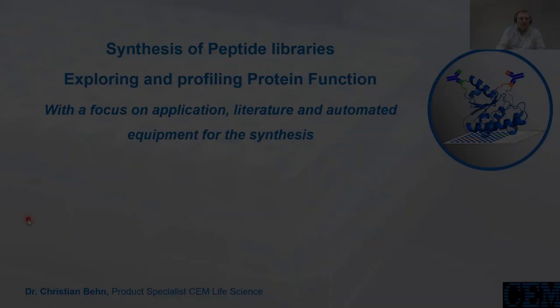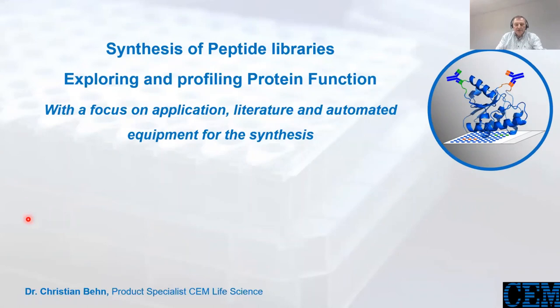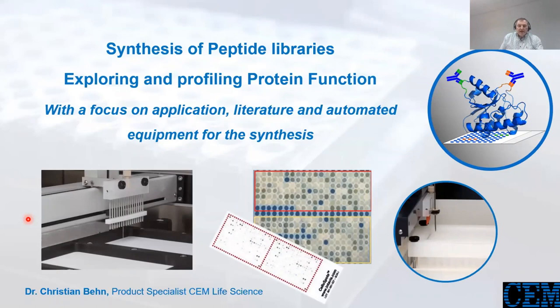So we are in now. I give you a little overview of synthesis of peptide libraries and arrays. Especially interesting is, of course, the protein function, which is behind. And my main interest, as Deirdre mentioned already, is the screening of proteins. And I have here some focus on application out of the literature. And of course, I would like to show you the equipment we are using to synthesize peptide libraries on cellulose membranes, as well as on little slides.